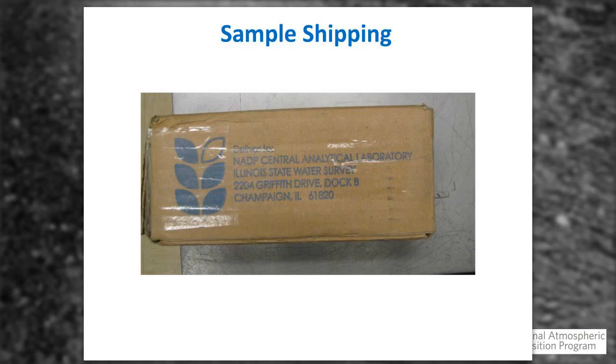Make sure the labels where you're shipping it are nice and clear with the different delivery systems that we have, which I'll address in a minute. Sometimes these labels get covered up. You're sent the CAL address labels as well as the sticky labels, not to mention the pre-printed side of the box here. So make sure that those are legible and clear. Don't cause any delays in our shipping.